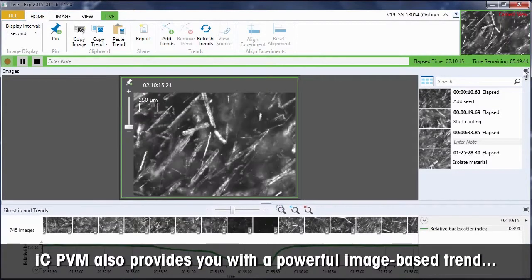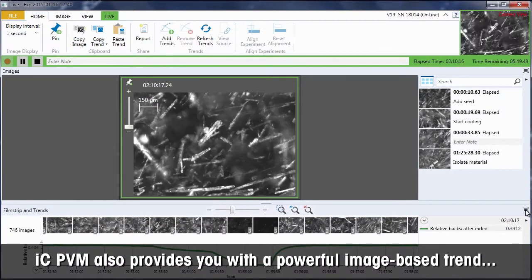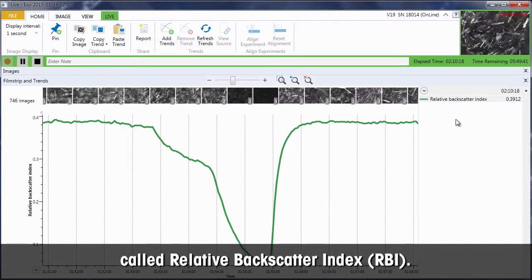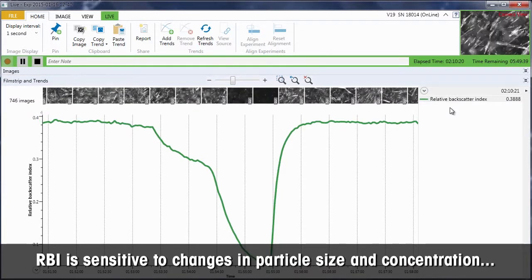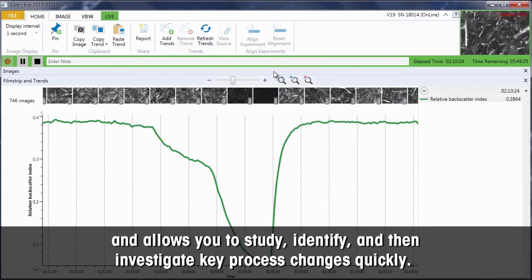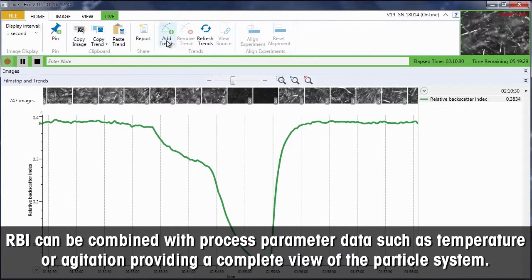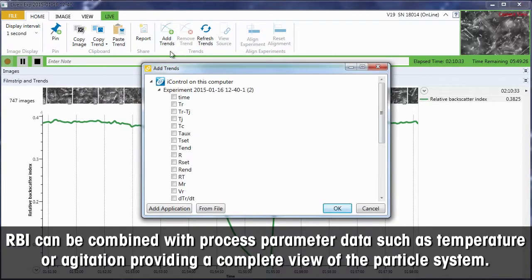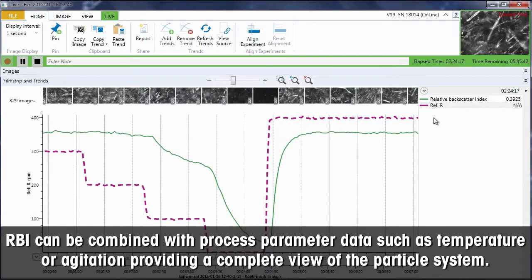ICPVM also provides you with a powerful image-based trend called Relative Backscatter Index (RBI). RBI is sensitive to changes in particle size and concentration and allows you to study, identify, and investigate key process changes quickly. RBI can be combined with process parameter data such as temperature or agitation, providing a complete view of the particle system.